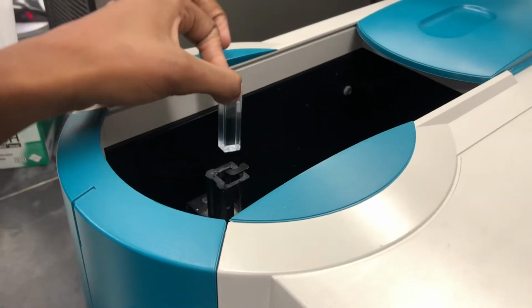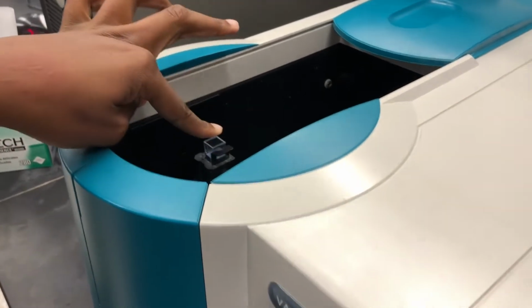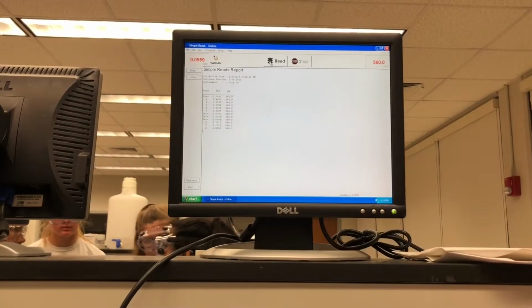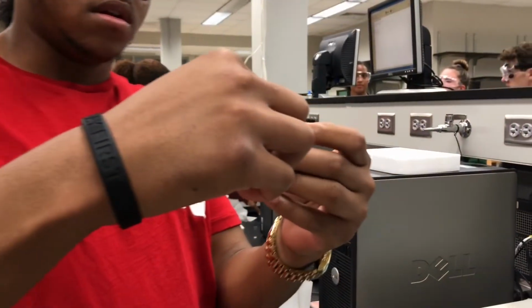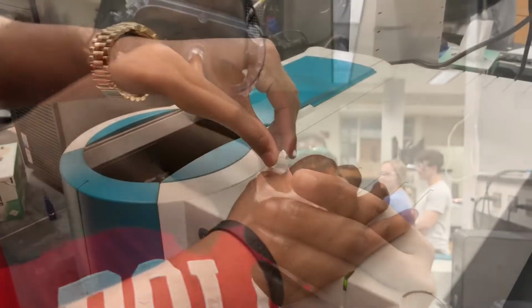The reason why you should scan across all wavelengths when using a spectrometer is to form a standard curve for a graph, and also to find the lambda max. The lambda max is the wavelength along the absorbance spectrum where a substance has the strongest photon absorbance.